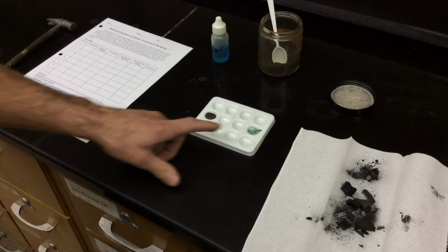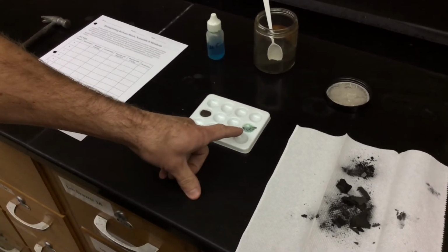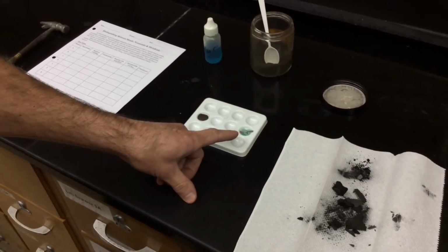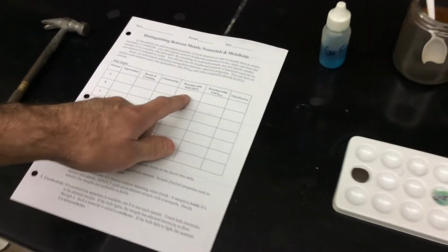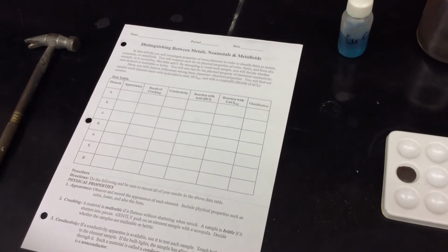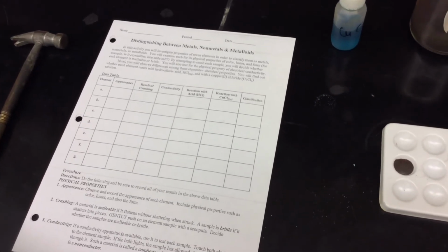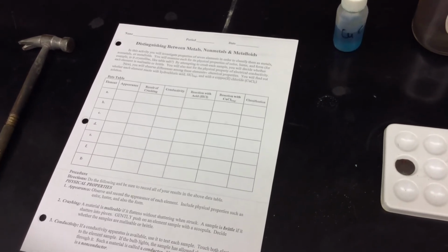So don't just write yes or no on the paper. If it's yes, say what happened. Like this one is obvious what's going on. You see some bubbling, but if you're able to pull that out with forceps, you would also see there's a color change going on in there. And one of the things that's good with this lab is if it reacts with one liquid, it's going to react with the other. But we want you to test with both liquids because sometimes one of the reactions might be very hard to see. And if you just do one liquid, you might be missing one of those reactions. So still test with both liquids.